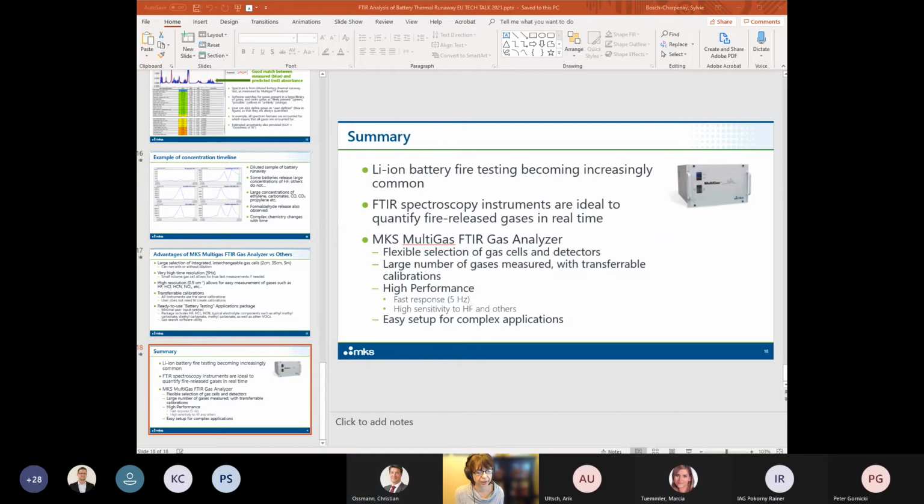You need to have some familiarity with the instrument, but a lot of your users know how to remove the gas cell to clean mirrors and whatever else. And this is essentially replacing the 5-meter cell with the 2-centimeter cell, or vice versa.